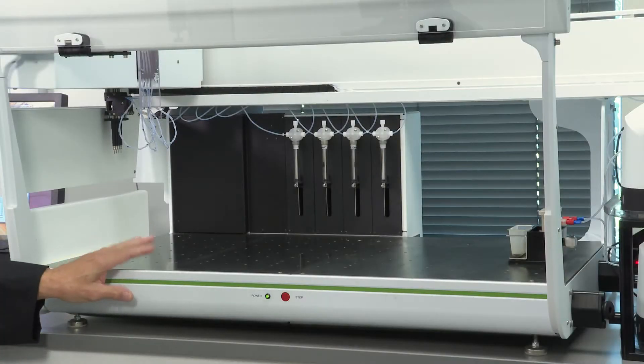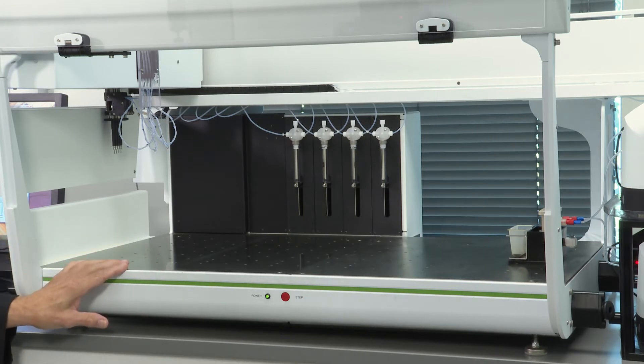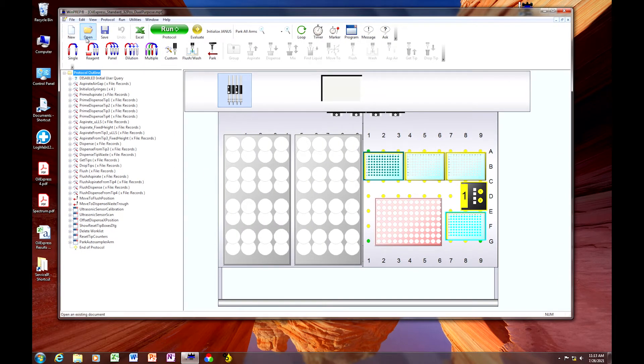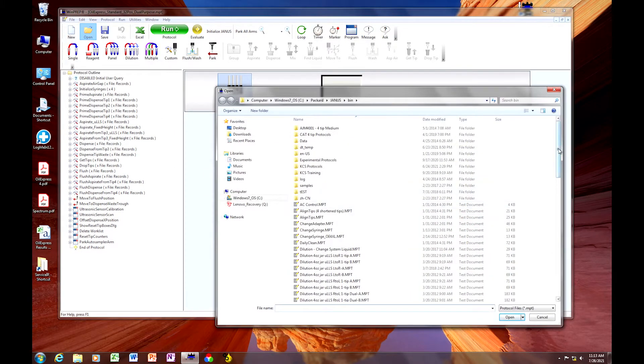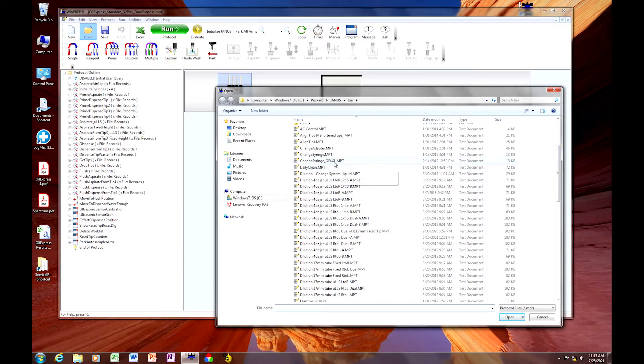The first thing you want to do is clear the deck of your instrument and make sure that you do not have any labware that might be in the way of accessing the syringes. Open the software into WinPrep. Go to WinPrep Open, Protocols, and select Change Syringe — in this case OE4XL.